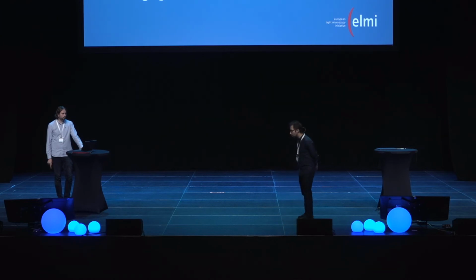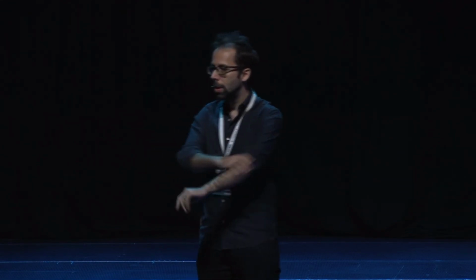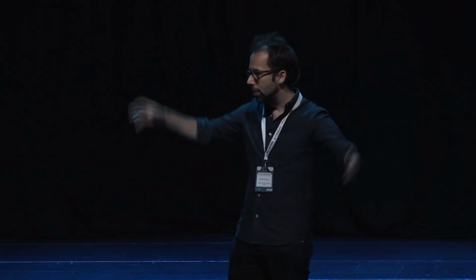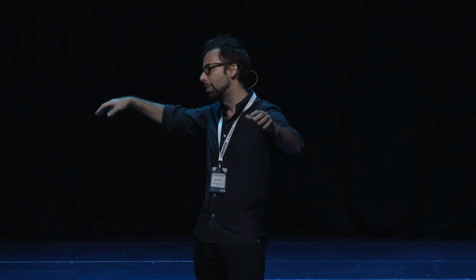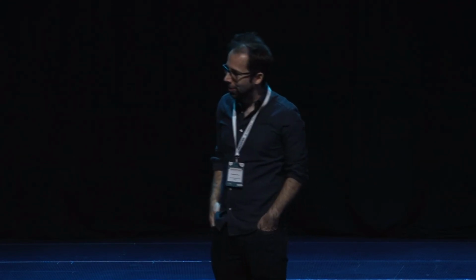Yes. So on ZeroCostDL4Mic itself, we do not. But in the BioImage Model Zoo, we do. The BioImage Model Zoo ends up being a repository for all the notebooks and all the models that people are training, and they're fully compatible with ZeroCostDL4Mic. So the BioImage Model Zoo is kind of the Google of deep learning, where you pick up all the resources. ZeroCostDL4Mic is one of the tool sets that you have there, and it's cross-compatible with models, and those models would then be runnable on Fiji, ilastik, and many other interfaces beyond ZeroCostDL4Mic also.